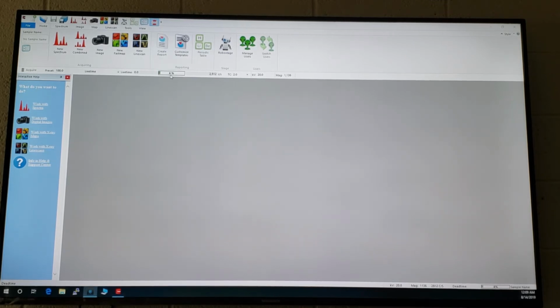So this 5% dead time is nice then. It's nice. What's really nice is we could generate 100,000 counts a second. If I open up to the biggest aperture, I'll get 100,000 counts a second out of this bad boy, and the dead time is like 30%. So if we had an unacceptable level of dead time, what would we do to correct it? You change your probe current. Less beam, less counts. Right now I've opened up my lens. Less counts, we have less information to process, so it can keep up. So we want maximum counts with minimal dead time.